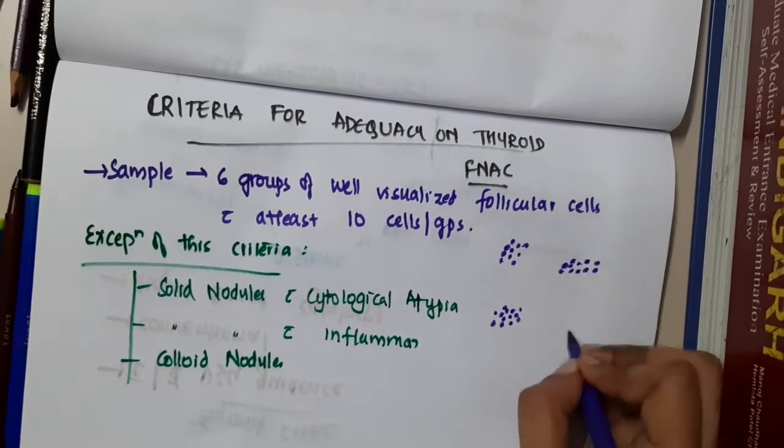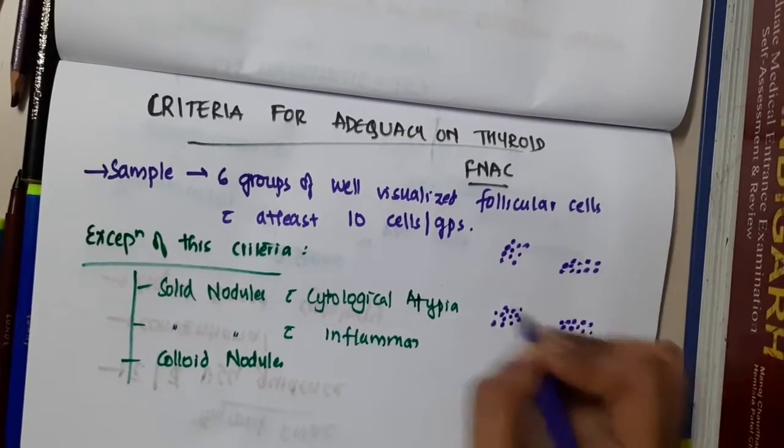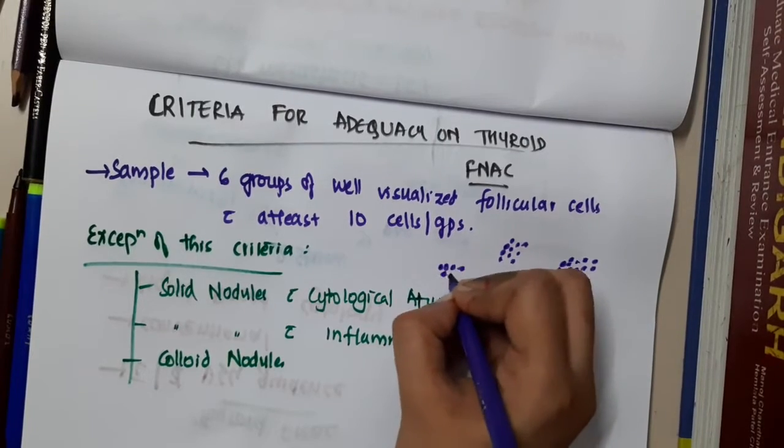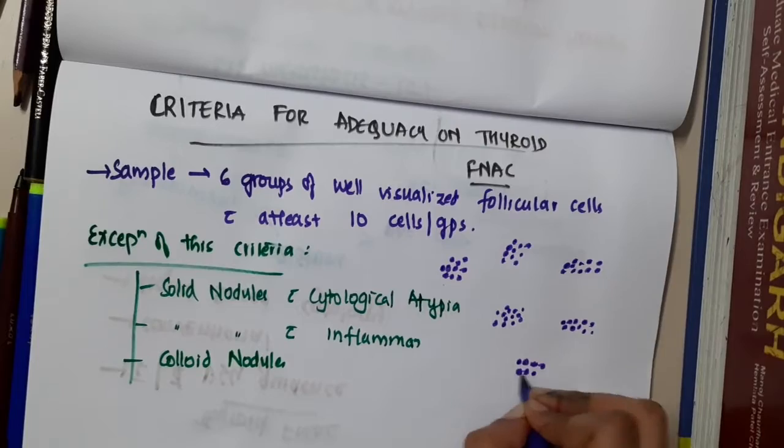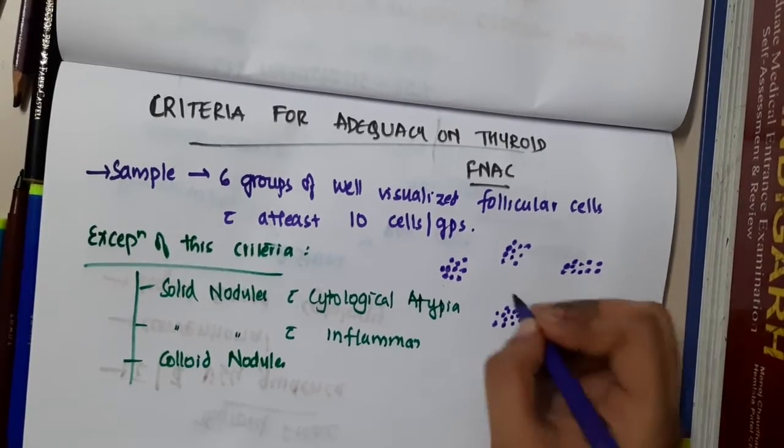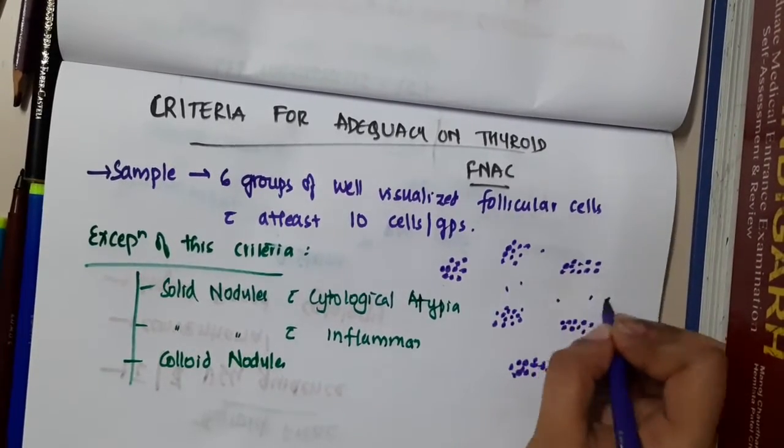This is more than 10 cells and this is one more group with more than 10 cells. This is one more group with more than 10 cells. So total we have 6 groups here with more than 10 cells.